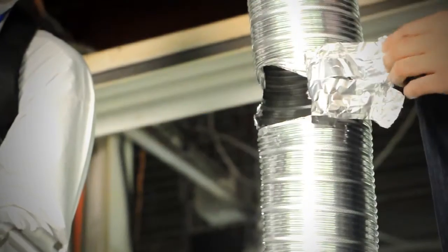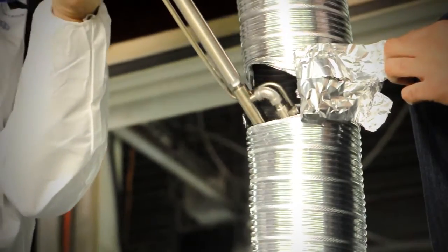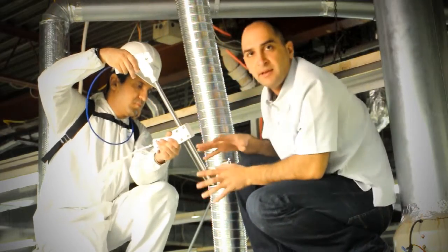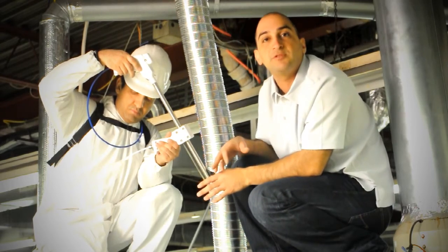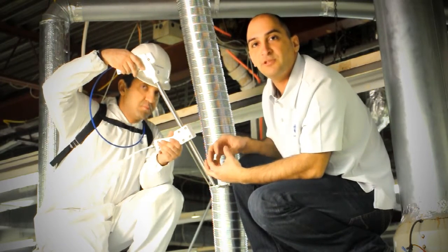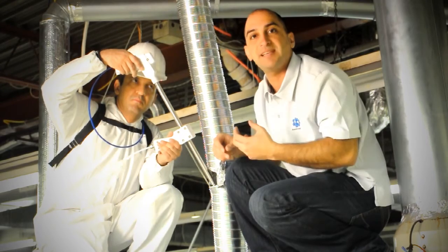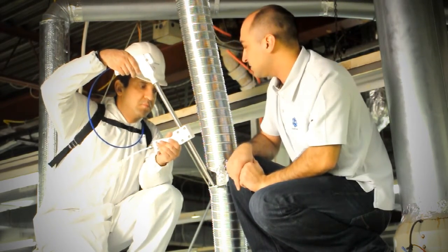So let's start. First, I'll take the cap off — just carefully, it's kind of hot. Darius is going to insert the probe in, and we're going to wait for about 10 seconds while everything comes to temperature. That means our probe will be at the same temperature as the stack.